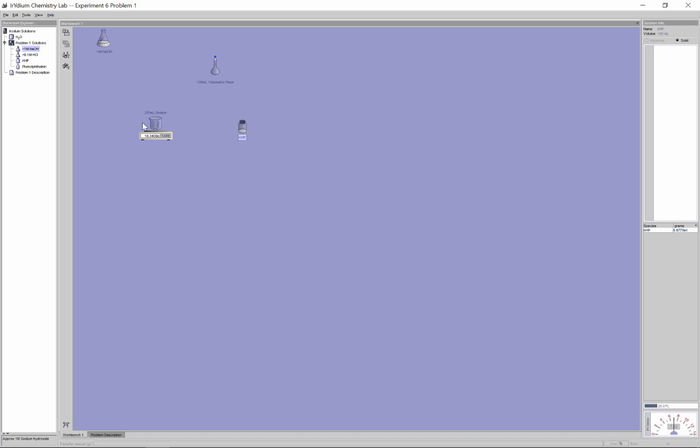What we want to do here is now dissolve this. Remember, the beaker's markings aren't really precise. I don't want to dissolve in 100 right now and then find out later on that's actually more than 100. So I'm going to pull out my vat of water here. I'm going to transfer the water in here, just something less than 100. Let's say I want to pour in 30. Again, just type down on that transfer bar here. I'm going to transfer in 30 here. It animates that for us. Use a stir stick here to mash up some of the powder.